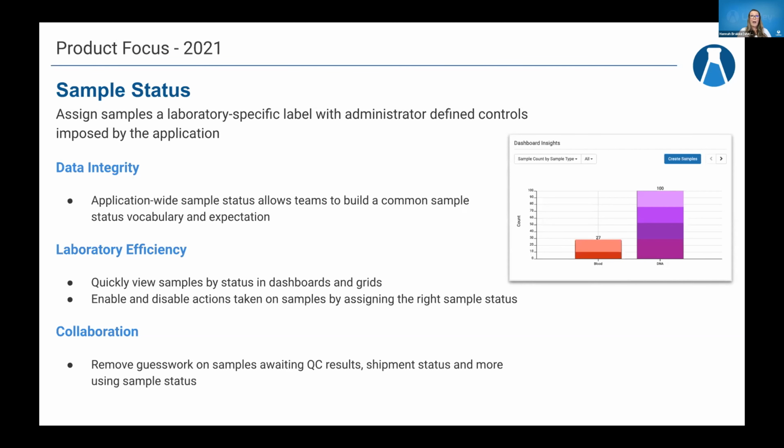And when you tag your samples with this, we also restrict. So if this is something that is locked, then we're not going to allow you to do much in the system with this, but it's still going to be there and viewable. It's just confined by the status.